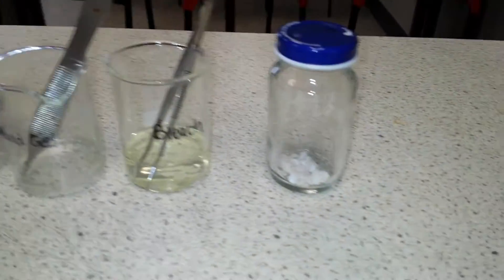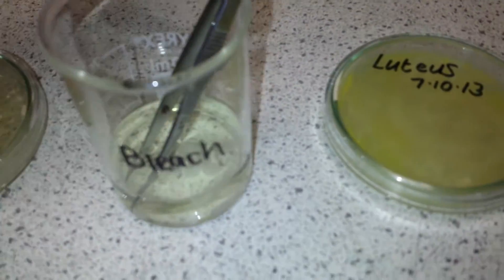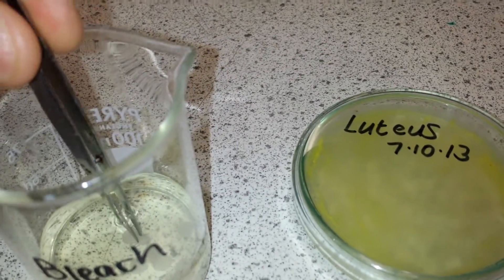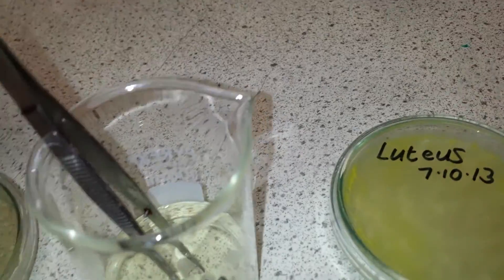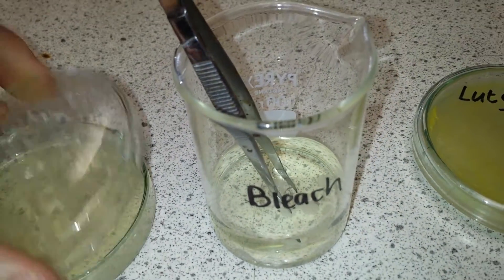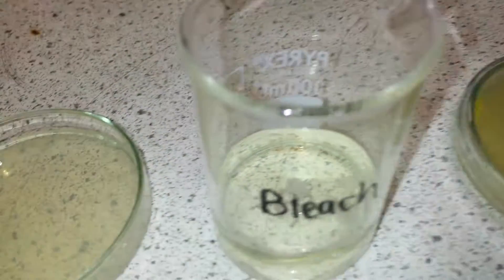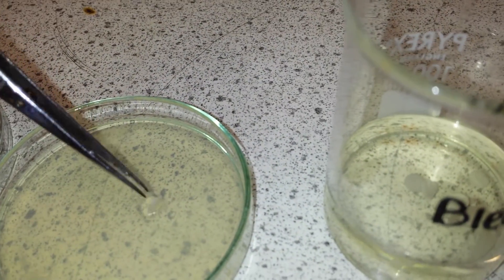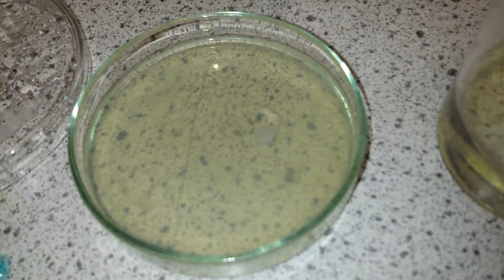We'll just do one sample as an example. Here we've got some bleach, and I'm going to take a paper disc that has been soaked in the bleach. We take the lid off our sample and add the bleach-soaked disc into the prepared dish.